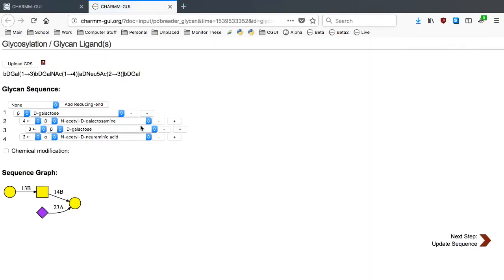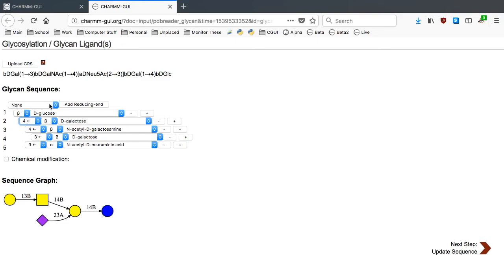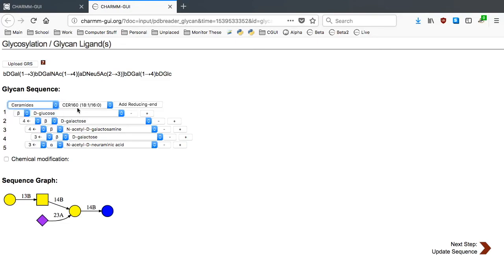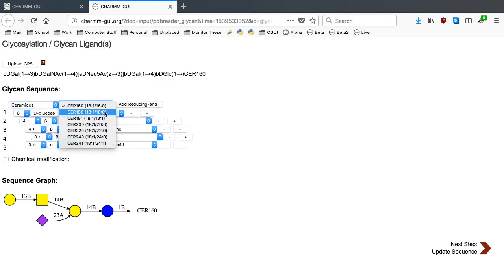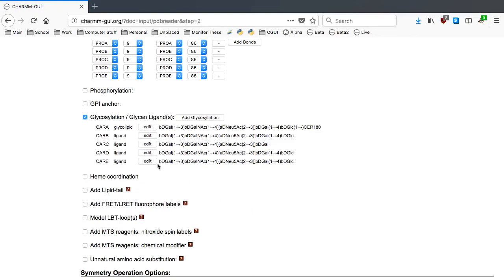We have a new popup window, and we need to first add beta-glucose at the reducing end to the galactose with a beta-1,4 linkage. Then add a ceramide tail by clicking None and choosing CER180 to build a complete ganglioside GM1. Now we can click Next Step to update the sequence.